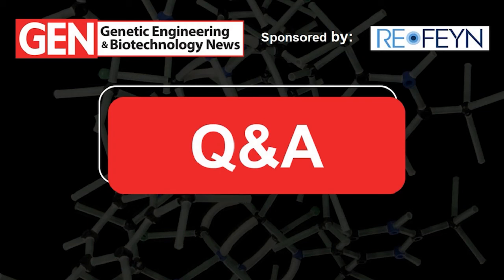All right, thank you for that. So the next question an audience member has is, do refractive indices differ between empty, say protein, intermediate, and full, protein and DNA together? Yes, that is the very basic of the technology. So there's a change in the refractive index, hence we see a change in the contrast on our camera, and therefore we can detect the difference in mass. That's correct.